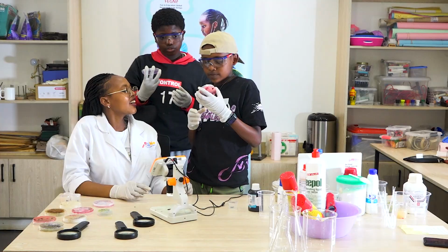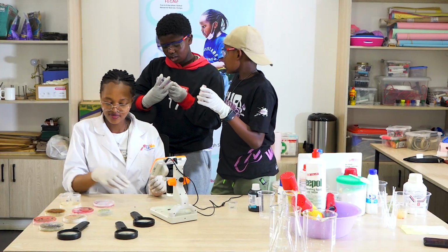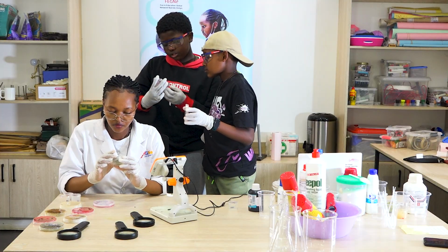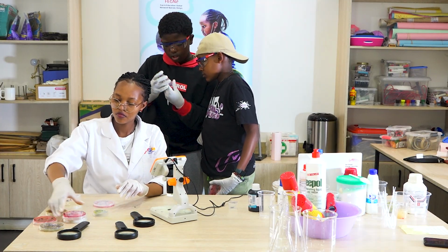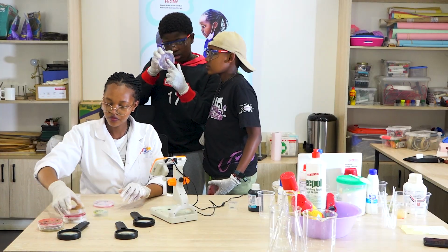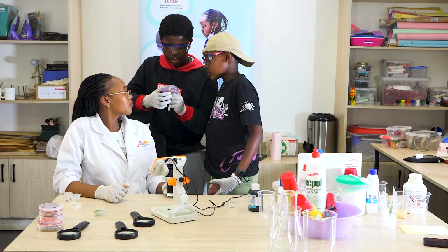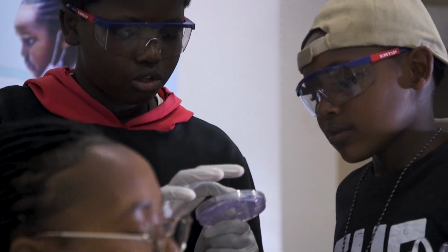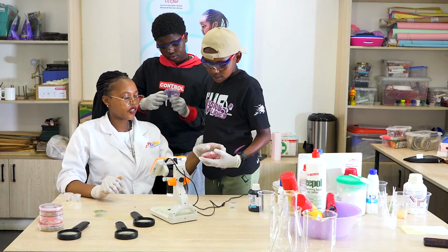This is for fungi. Fun guys, man. For this bacteria, you can see the streaked pattern. Most of the time it's done like this so that they can grow in colonies, but as you can see right over here, there are some that have decided that they want to do their own thing, and they went outside of the colonies, so they're not in the gridded pattern. Okay, good bacteria. It's also really fun.